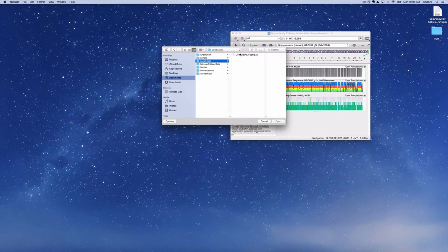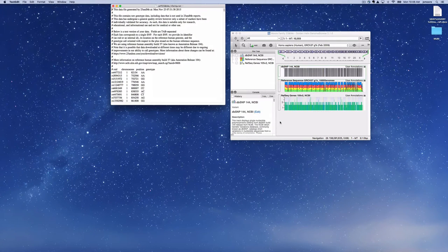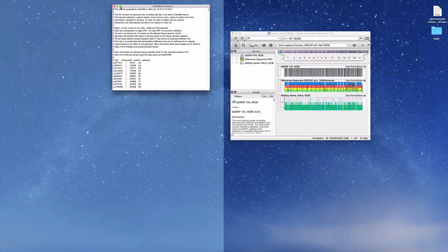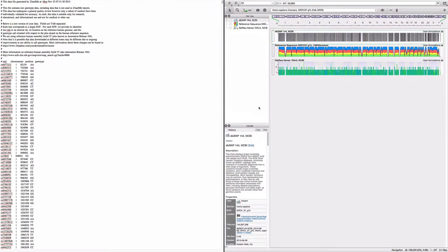Alright, let's import your 23andMe data into Genome Browse for a powerful visualization experience. I like to display the file of raw data beside a Genome Browse window.